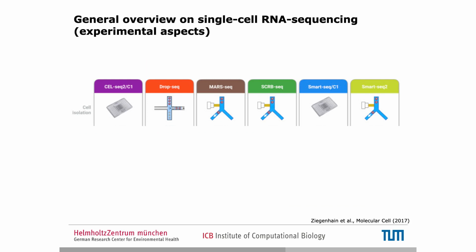I already mentioned the 10x platform. We have several ways to do library preparation of single-cell RNA sequencing protocols. So here I depicted 6 different protocols that are mostly available and mainly used. They differ, of course, and they also have different purposes.